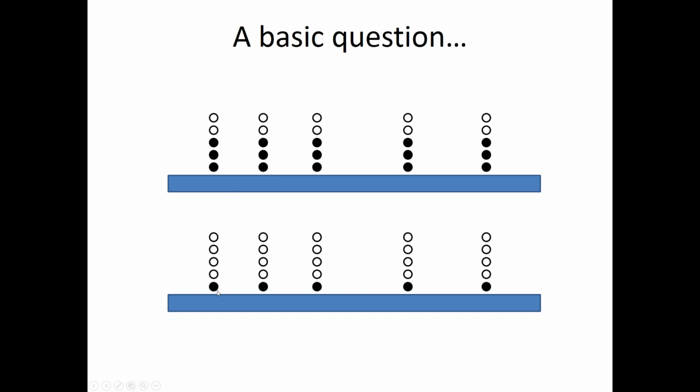Now we have two samples where we're trying to compare the methylation calls between the two. The question we're asking is, are the calls that we get from the two samples consistent with them coming from an underlying methylation population which is exactly the same between the two? In this case, we can see that there's more methylation in the top sample than the bottom one, but what the statistics are there to tell us is whether we could have seen something that looked this different just by random chance through sampling variation. That's what we're trying to address in our statistics.